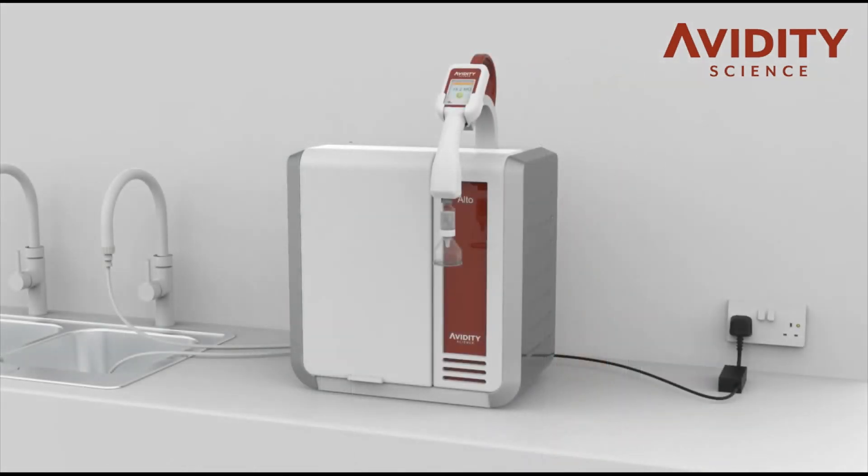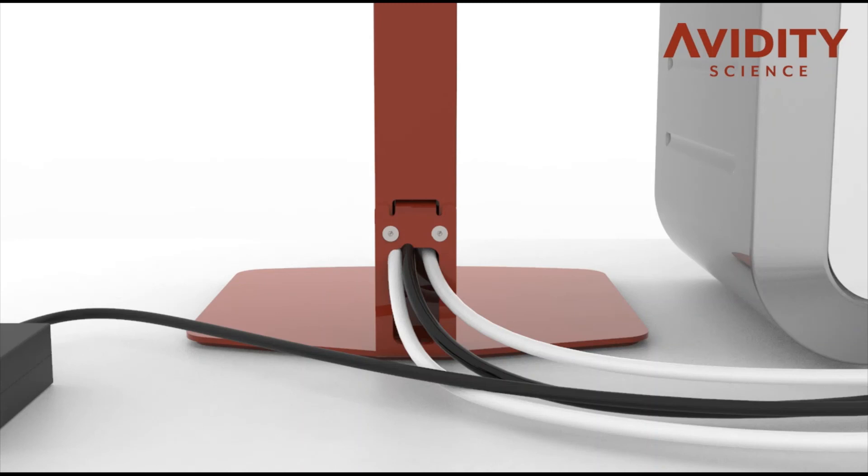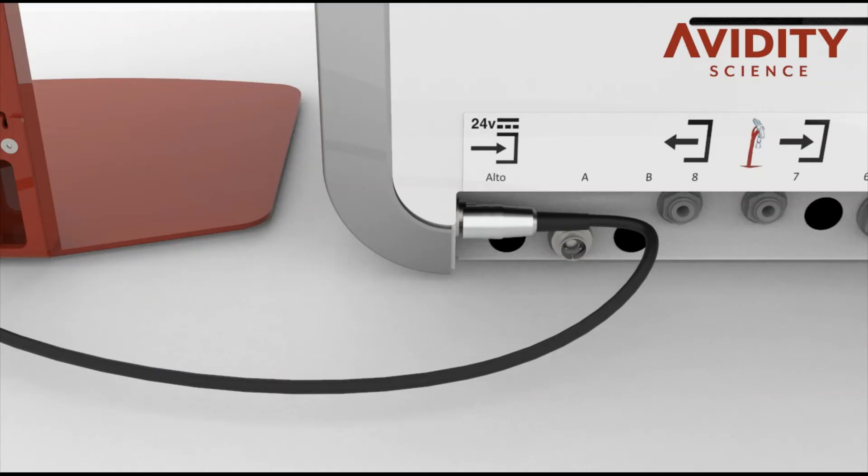For the remote dispense option, the dispenser must be no more than 2.5 metres away from the system. Insert the tubes from the remote dispenser matching the symbols on the system. Insert the remote dispenser power cable into port A and lock into place by turning the collar clockwise.